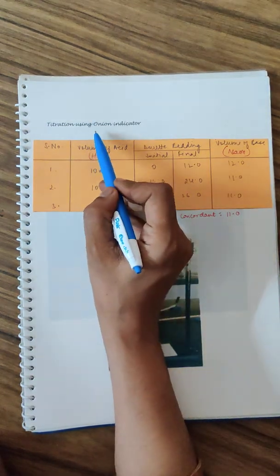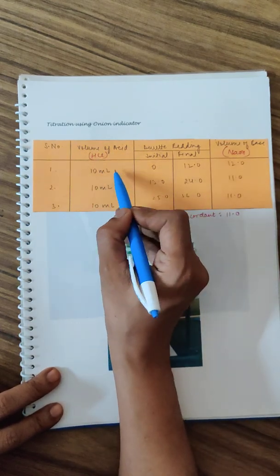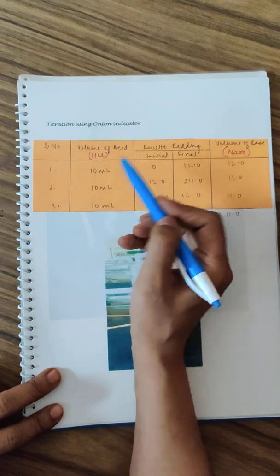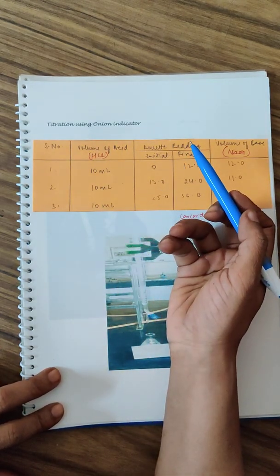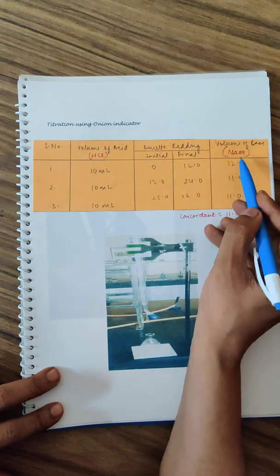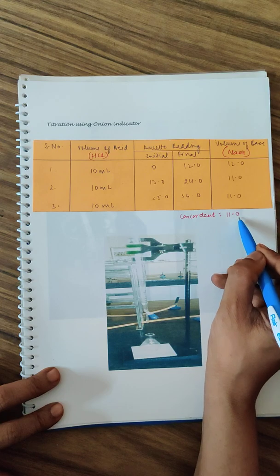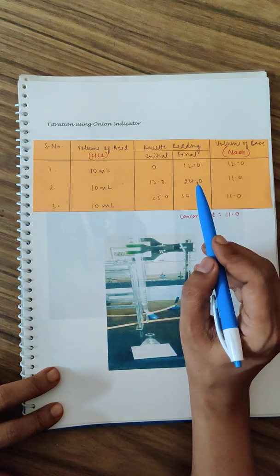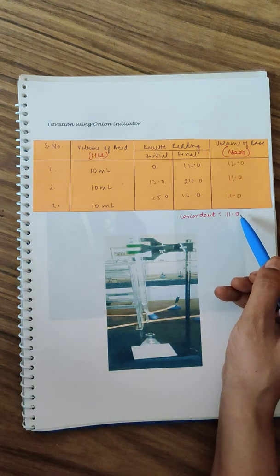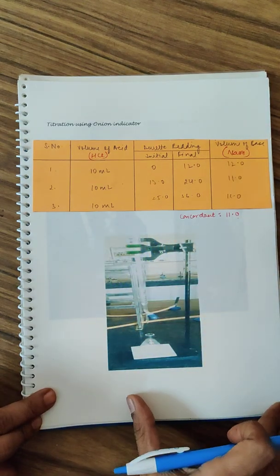The same thing needs to be done with the onion peel indicator. Volume of the acid in the titration flask - take 10 ml of HCl that you have prepared. Add two drops of your onion peel indicator. Burette reading me NaOH hai. Initial and final measure karke, you find that the two same readings are 11, so your concordant value is 11. This is closer to phenolphthalein. The indicator can replace phenolphthalein. You will use some pictures while you were performing the practical.